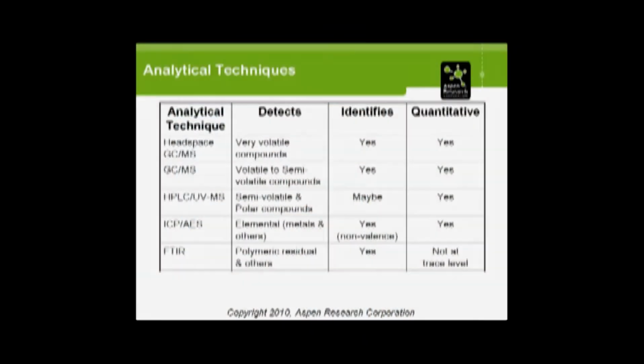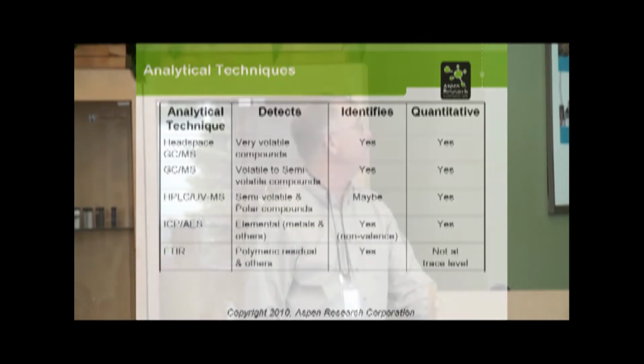And then, generally, when you do the extraction, you kind of like to get an idea in a gross sense of what's the mass of material per mass extracted that's been taken out by a given solvent. So you might use a gravimetric residual, and then you kind of like to get an idea of what that major mass material is. And we use FTIR infrared for that. You can get at least a general category characterization of what those are, but it's usually not very quantitative.